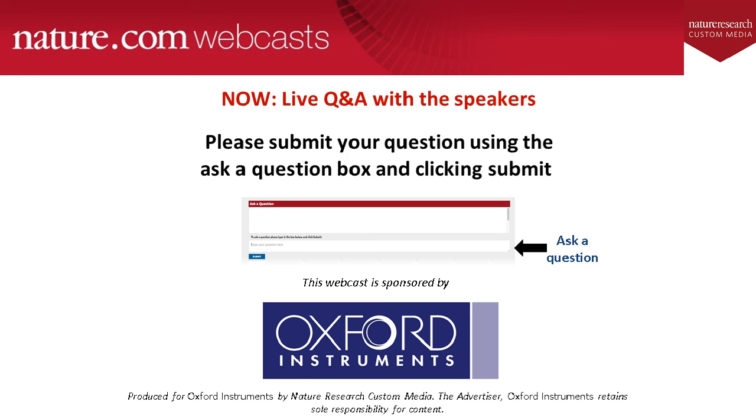Excellent. Thanks, Louise. Our next question asks, do you think there are any advantages of performing, for example, cryo-FIB lift-out over sectioning? Erin, is that something you can help answer? Yeah, well, my first thought is that cryo-FIBs are pretty rare and it's quite difficult to do cryo-FIB lift-outs.